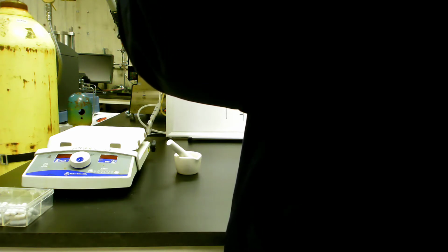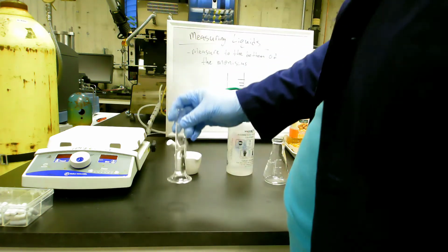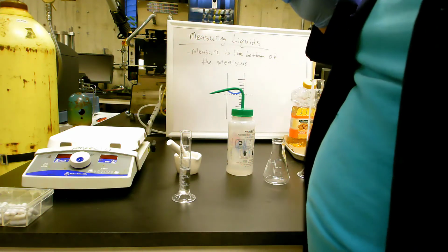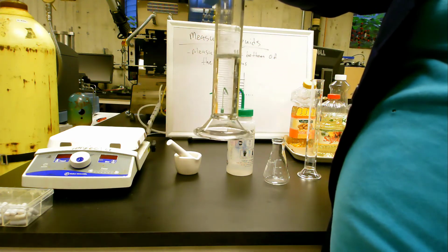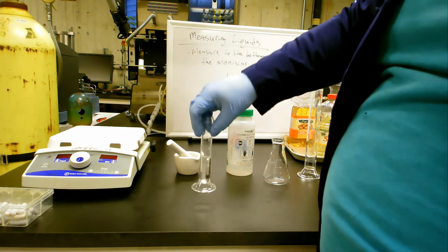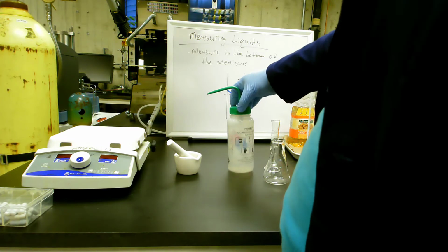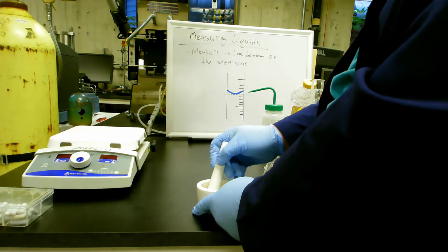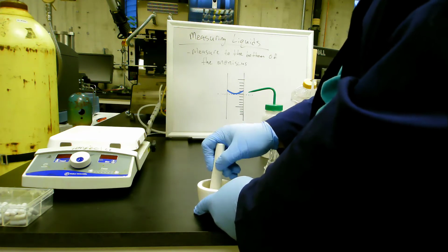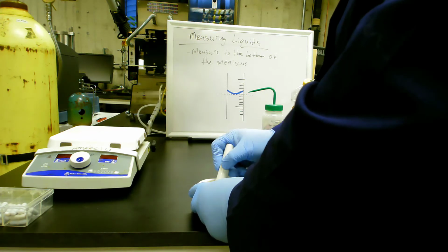As I mentioned before, it's important to deal with volatile liquids under good ventilation, and just out of the shot is our fume snorkel that is taking away any exhaust fumes. After measuring out our methanol, we're going to set it aside for the time being and grind up the sodium hydroxide with the mortar and pestle. So we haven't done this step yet because we need the methanol to help us remove the sodium hydroxide and get it into the Erlenmeyer flask.